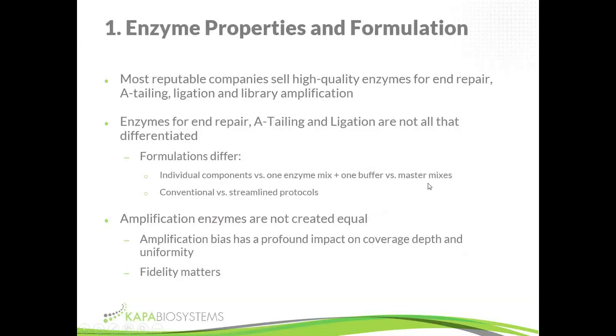Also, formulations for conventional and streamlined protocols differ, so don't mix and match things between kits. You probably can't use the ligation buffer from a streamlined kit in a conventional protocol, and vice versa. Especially with streamlined protocols, make sure to look at performance when you evaluate them, because some are well formulated with guaranteed performance, whereas some lose a lot of performance for the convenience and the speed.